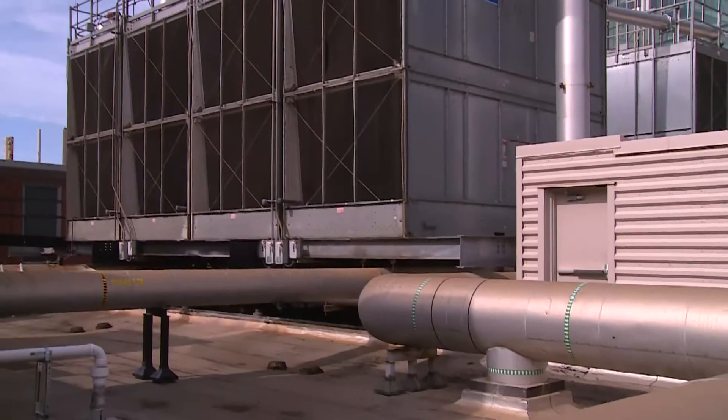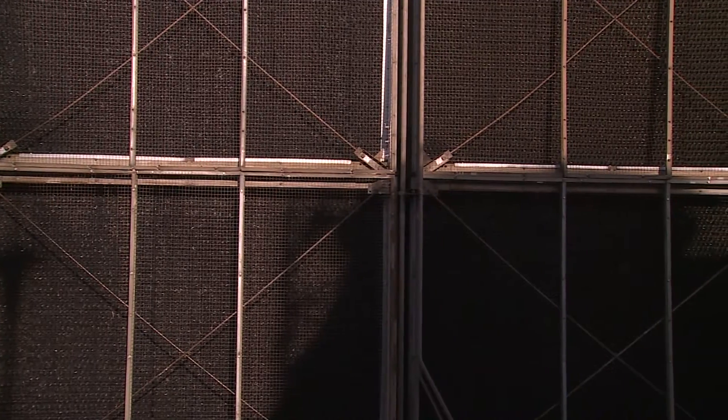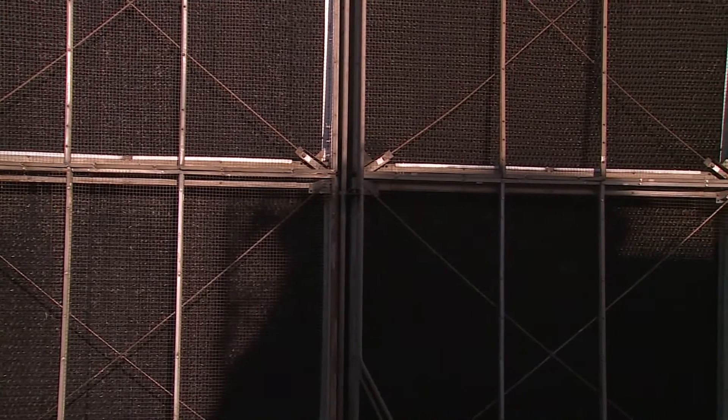Cooling towers come in different shapes and sizes. Engage an engineer or maintenance technician familiar with the particular device to identify appropriate sampling sites.